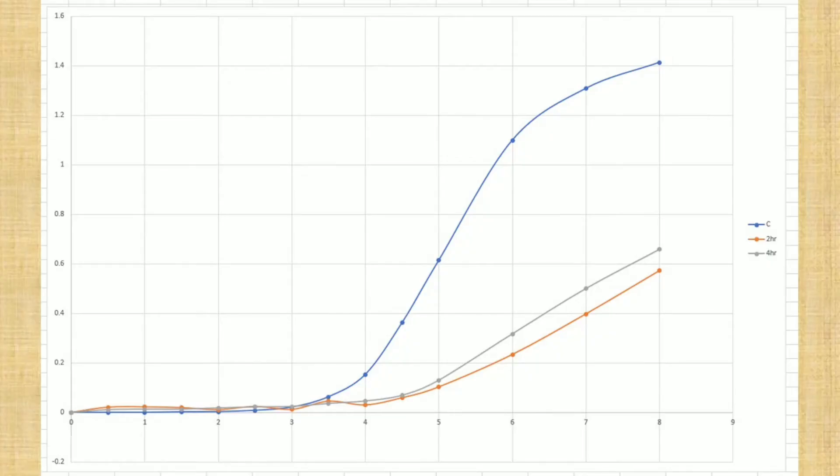You can see the performance of my homemade medium is quite bad compared to commercial medium, which is the blue curve on the top. It's not even half the efficiency and the bacteria grow much slower. Also, the different digest times have very little effect.